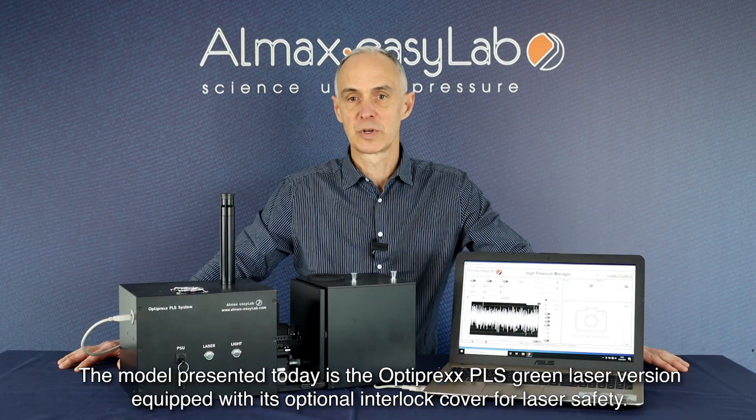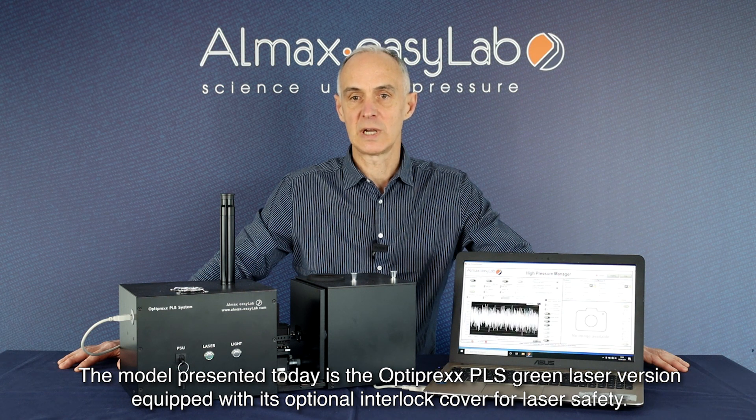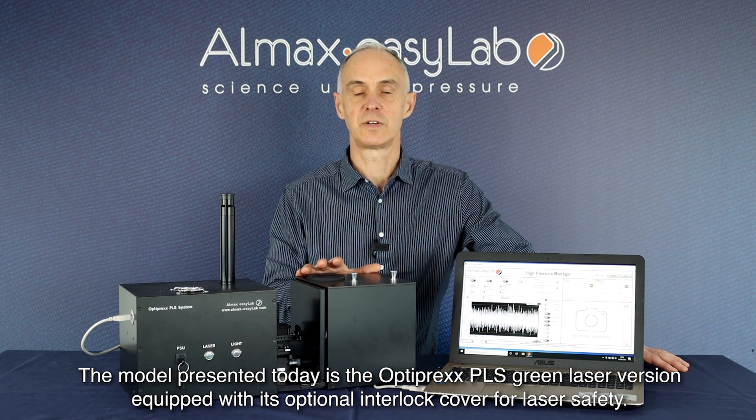The Optiprex PLS, or photoluminescence system, enables you to carry out this measurement in an all-contained solution in the comfort of your laboratory. The model presented today is the Optiprex PLS green laser version, equipped with its optional interlock cover for laser safety.